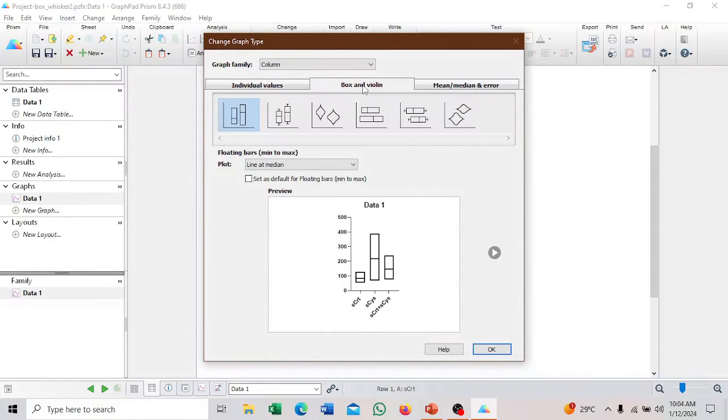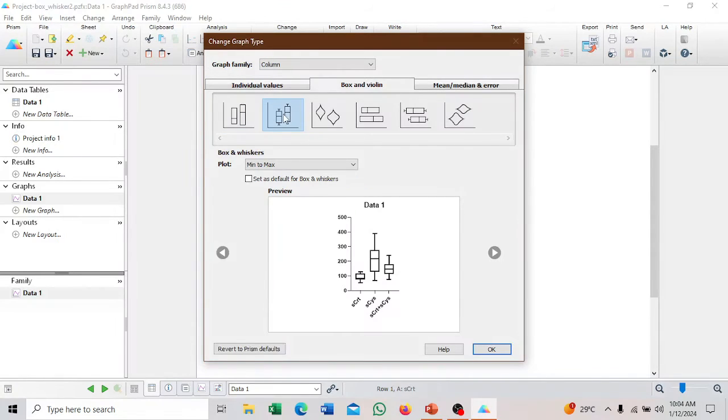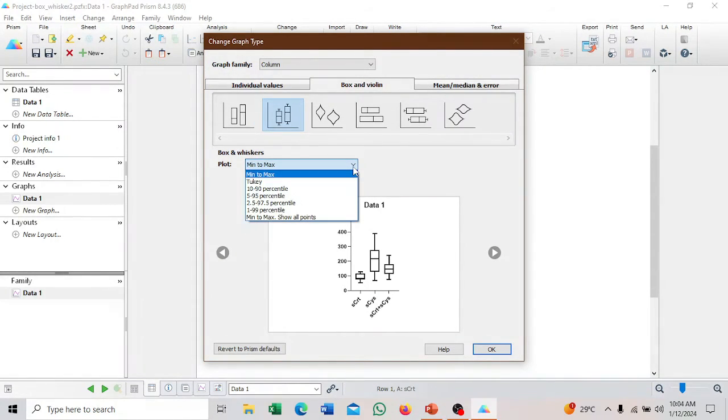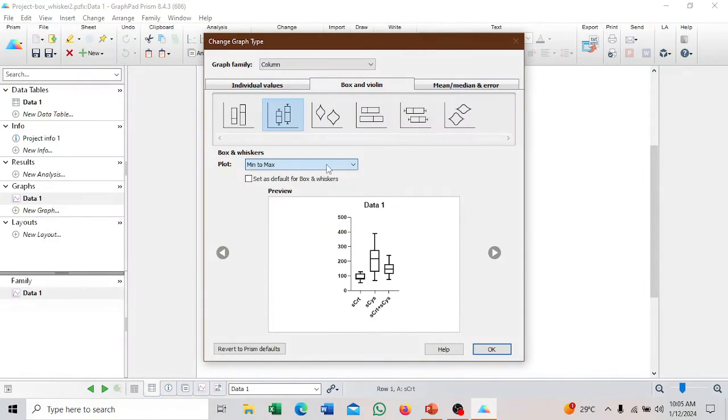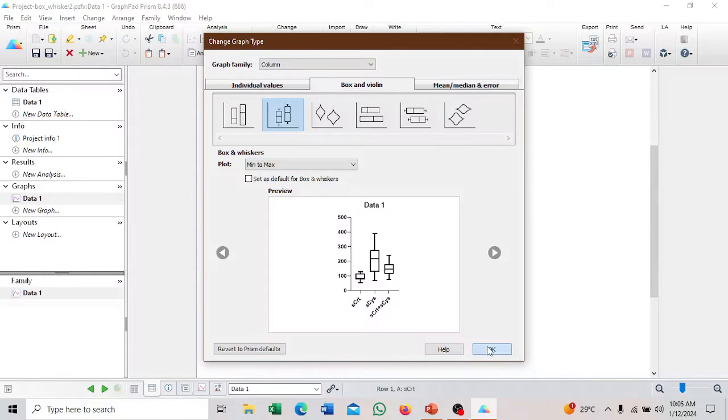Go here. This is the box, only box without whiskers, but we want a box and whisker. We select this one and we want it to display from the minimum to the maximum value. There are various options here. If you want the 10th to 90th percentile, the 5th to 95th, but we want minimum to maximum with a lower, median, and upper quartiles, or the minimum and maximum value.